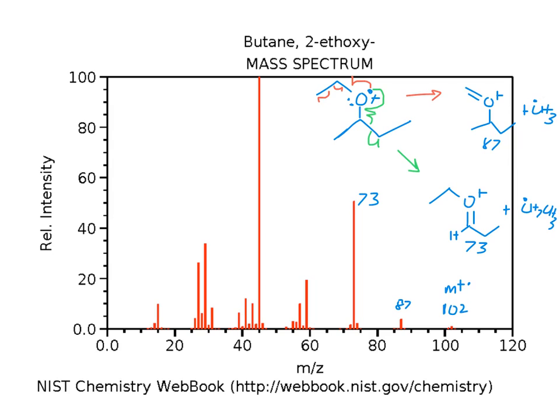Does it see the ethyl, right? Something seems odd here. Oh, there's a methyl group there. Only methyl. I stuck in a... And on the other side, there should be nothing connected, yeah. That's it. And there should be an H on that side. Yeah. All right, so that's 73.